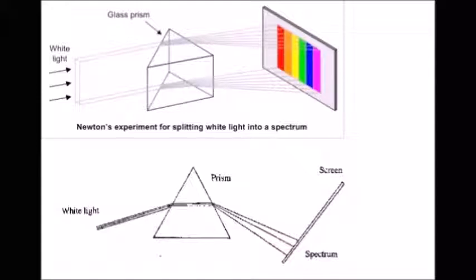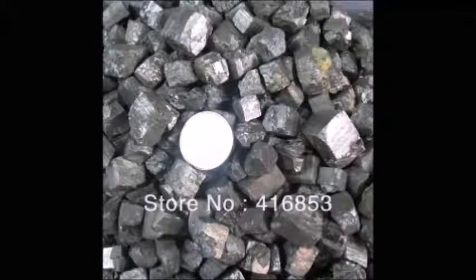Scientists have recorded the spectrum of all elements in the periodic table. All elements have a specific spectrum consisting of black lines on a colored background, and this is called an absorbance spectrum, or colored lines on a black background if it is an emission spectrum. We can make qualitative measurements for any sample containing a large number of elements by analyzing the resulting spectrum, to know if our sample contains iron or not, gold or not. We don't need to measure all iron line spectra; we choose only some characteristic lines for detection.